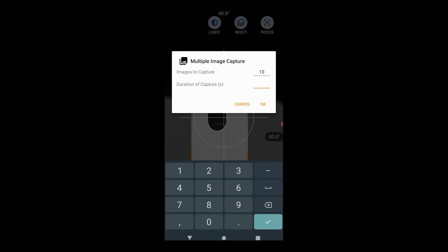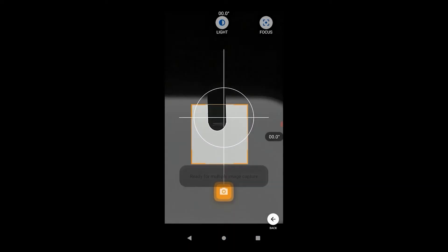Simply specify the number of images to capture and the duration of capture. Once you are ready, hit the capture button and start generating the droplet.